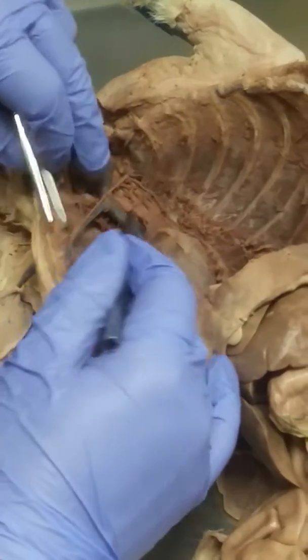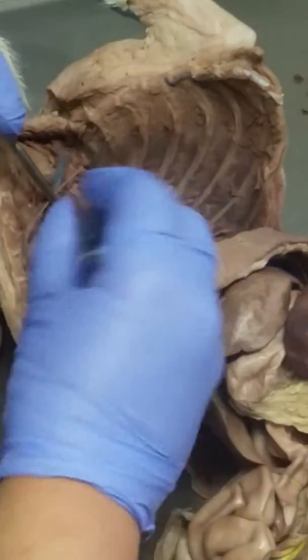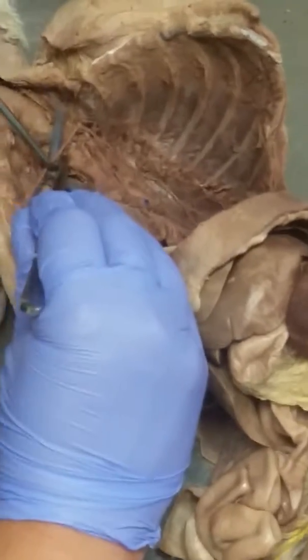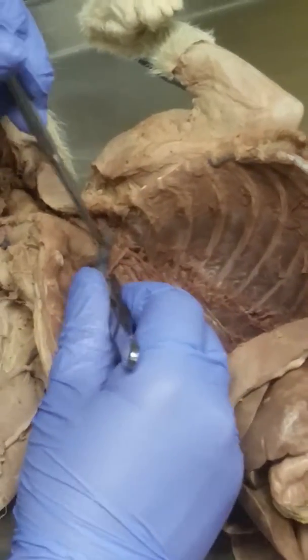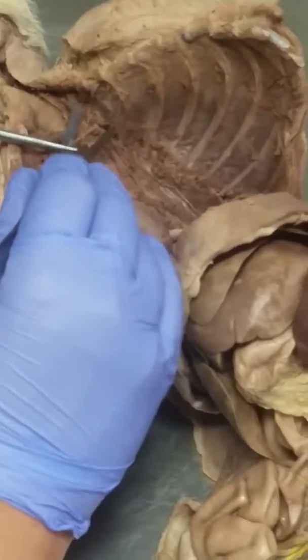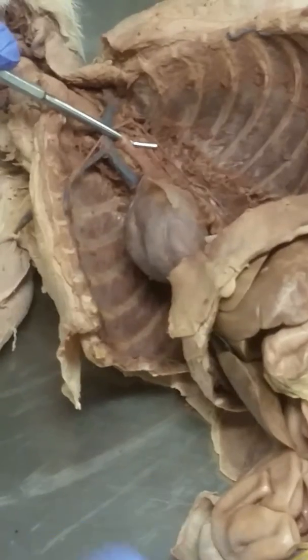Well, this is the brachiocephalic trunk, which means that this vessel right here, if I can get it, I don't want to snap this little vessel that I'm picking up, this one is the right subclavian artery, which means that this one over here that I'm picking up is the right common carotid artery.